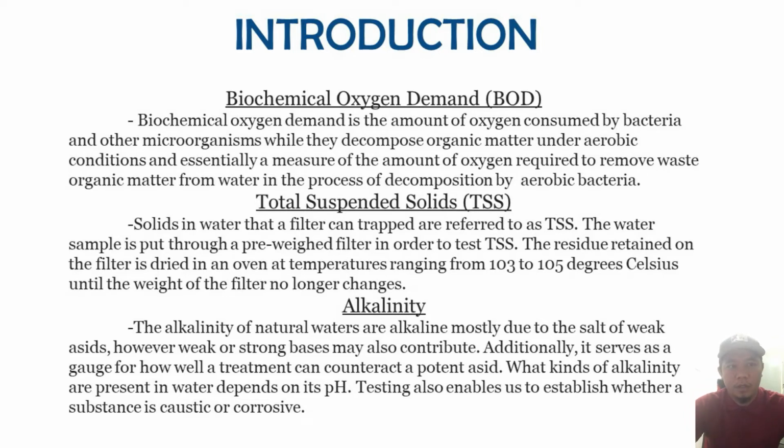And for total suspended solids, TSS, solids in water that a filter can trap are referred to as TSS. The water sample is put through a pre-weighed filter in order to test TSS.